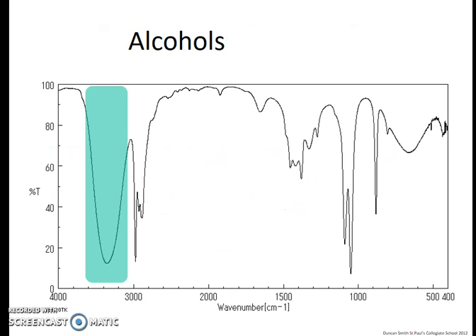Alcohols are wonderful. They're this beautiful, strong, parabolic shaped peak that you can see there highlighted in blue on the left-hand side. They're very symmetrical, they're very strong, so they get nearly 90% absorbance of your energy, and they are really, really clean. If you get a peak that looks like that, you can go, aha, I have an alcohol.